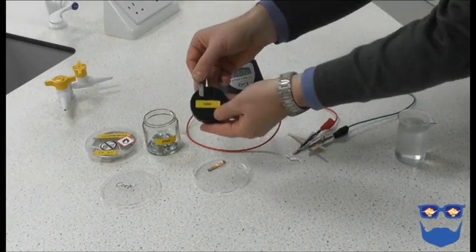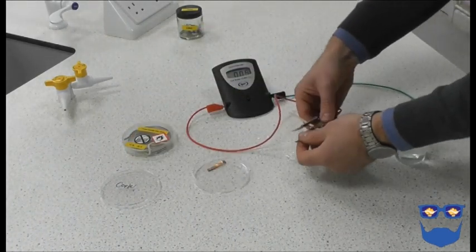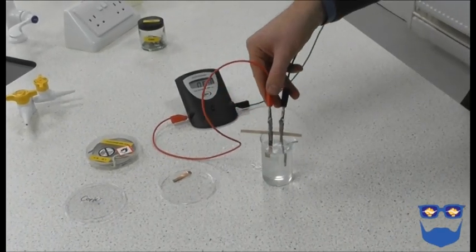Return the copper electrode to the positive lead. Return your zinc strip to the container and replace it with a magnesium strip. You should observe that the voltage is higher.